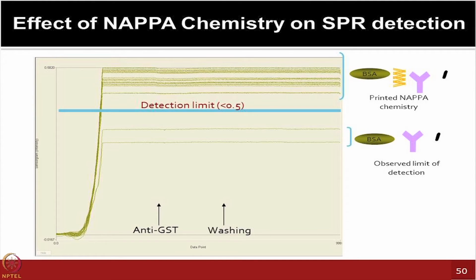This is the SPR imaging platform. I talked to you briefly about the technology, which is SPR imaging. You have been exposed to NAPA arrays. Think about combining the two to harness both their power.